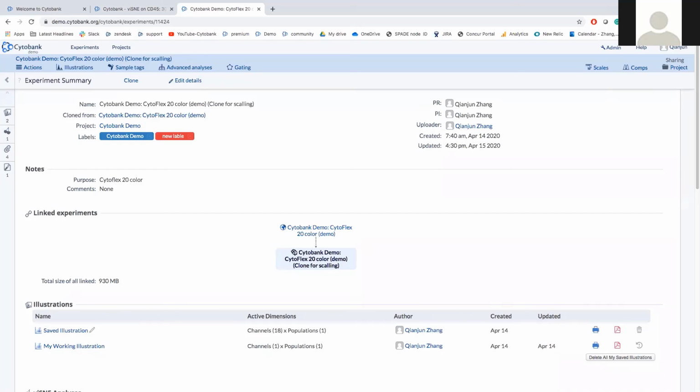The ACS files that Chen Jun mentioned can be exported directly from Cytobank. Within Cytobank, you can export the entire package of your experiment, which includes your FCS files, your gates, your compensations, your scale settings. It can include any downstream analysis you've done. You can export that all into one package as an ACS to archive it, and download that onto your computer to save it for however long you need. You can also extract the individual components from that. So the ACS that Chen Jun was referring to was what you can make in Cytobank.